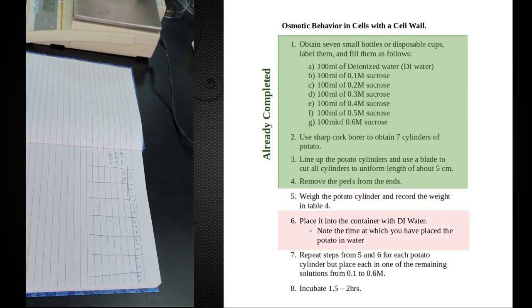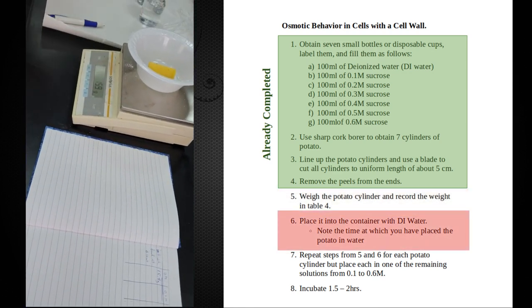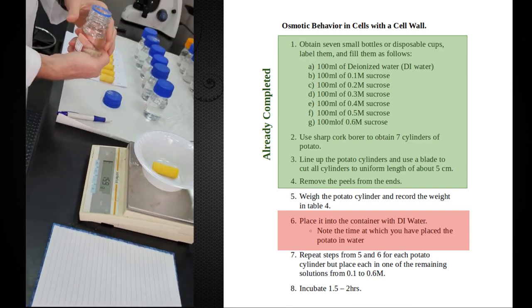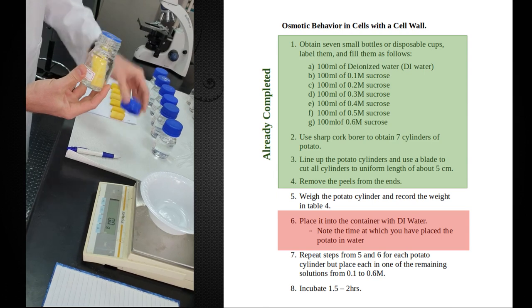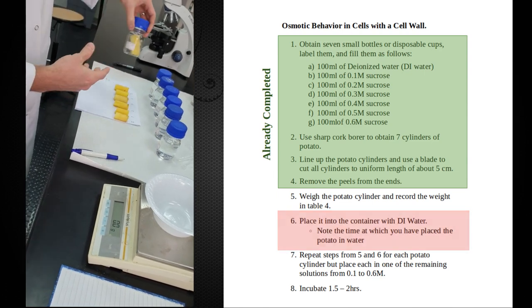And so I'm going to place that into the first bottle. So that's going to go into bottle number one, my deionized water. Just drop it in there, and leave it alone.